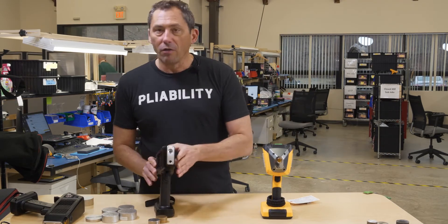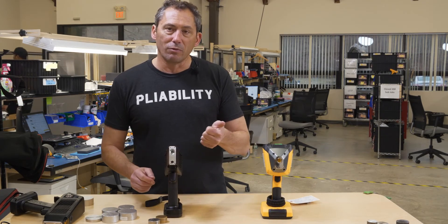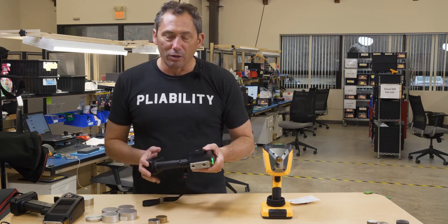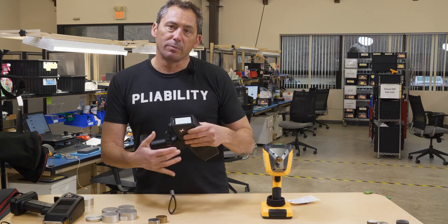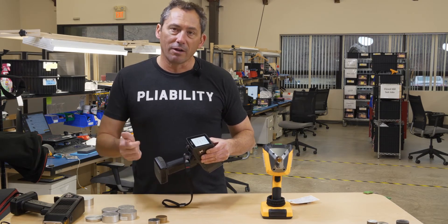This is really all the bells and whistles you'd want in an XRF. It's the lightest weight at 2.75 pounds. It's the best balance, a great design, it's durable, it can run all day long no matter what the temperature. It's fast and it's really purpose-built. For scrap, it's got alloy and aluminum and precious metals and car catalysts.